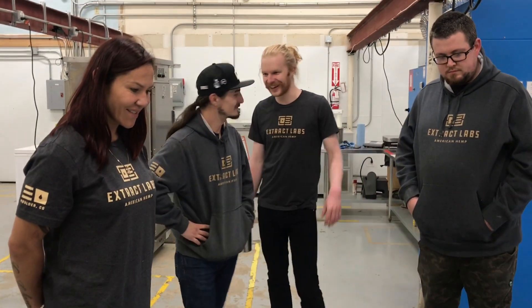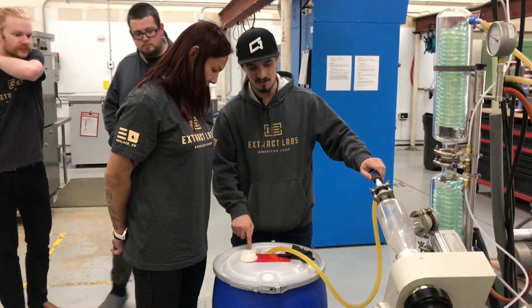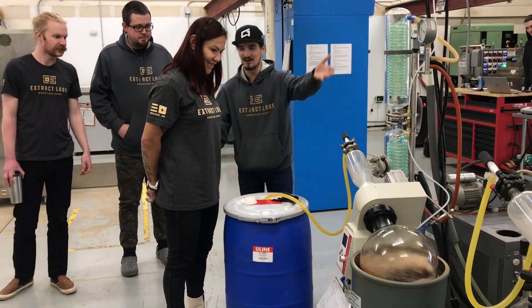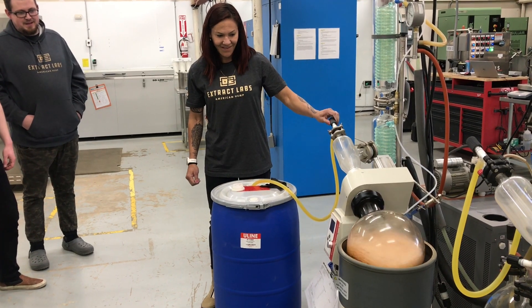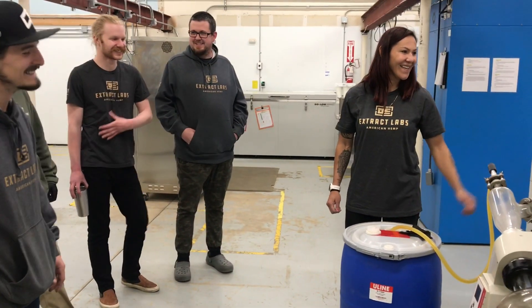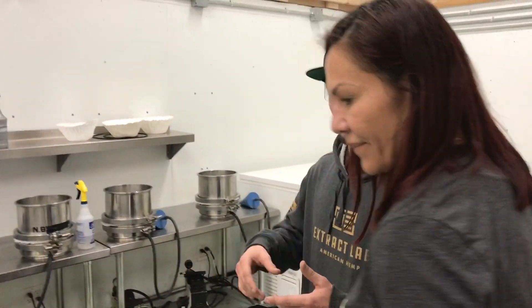This is where it all starts right here. This is a boiling flask right here — it's under vacuum, so it's sucking a lot. I showed you all that oil coming out on the machines over there. The oil has a lot of fats and waxes that come out with it. It's not something you want in your product, so this is where winterization happens. We mix that with alcohol, we freeze the waxes out, and then we filter it out.